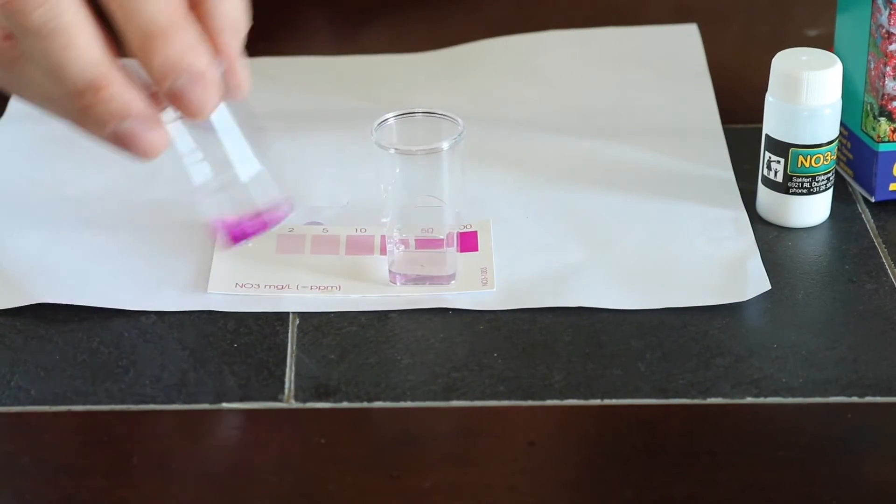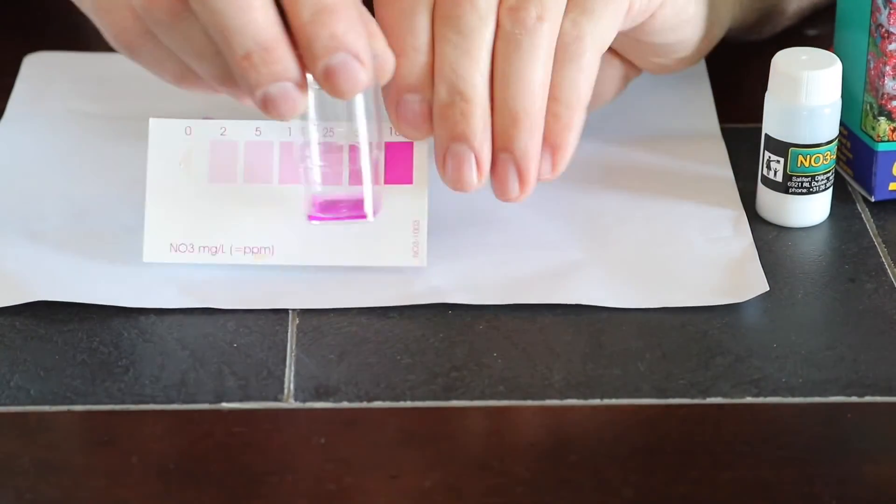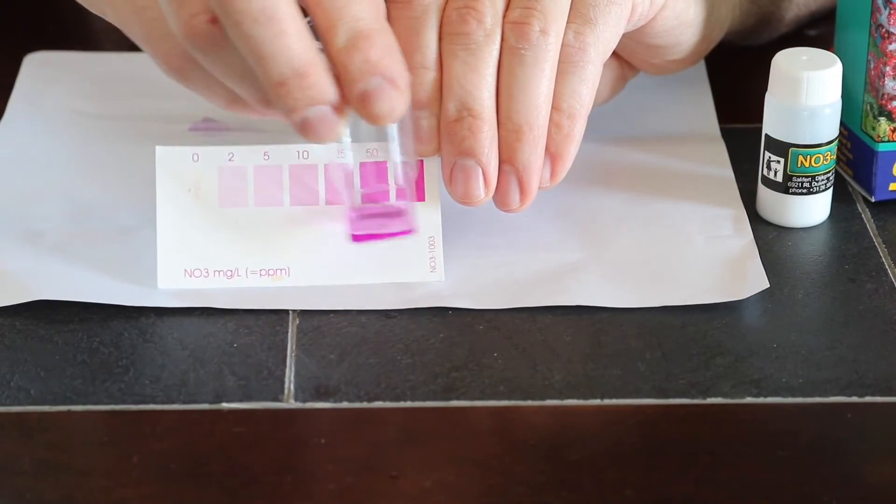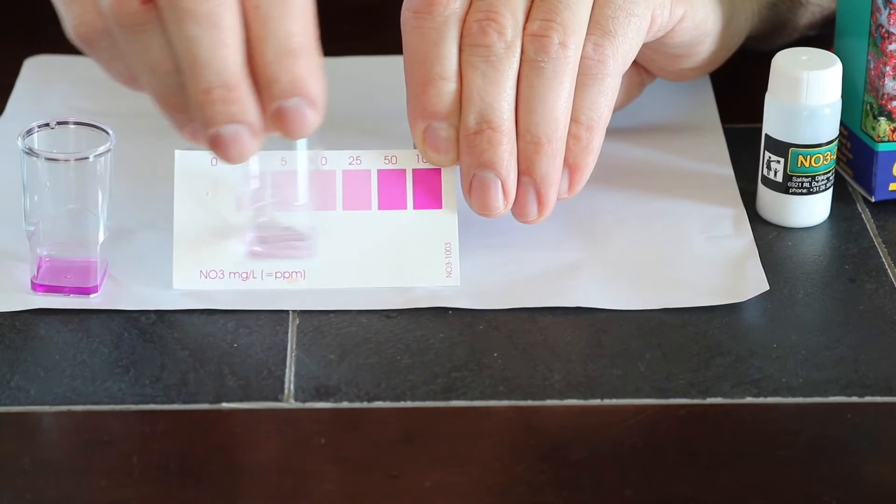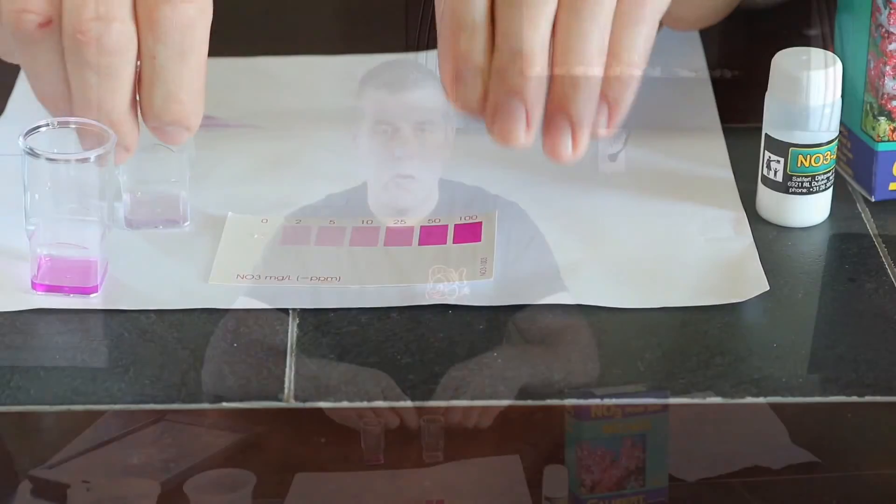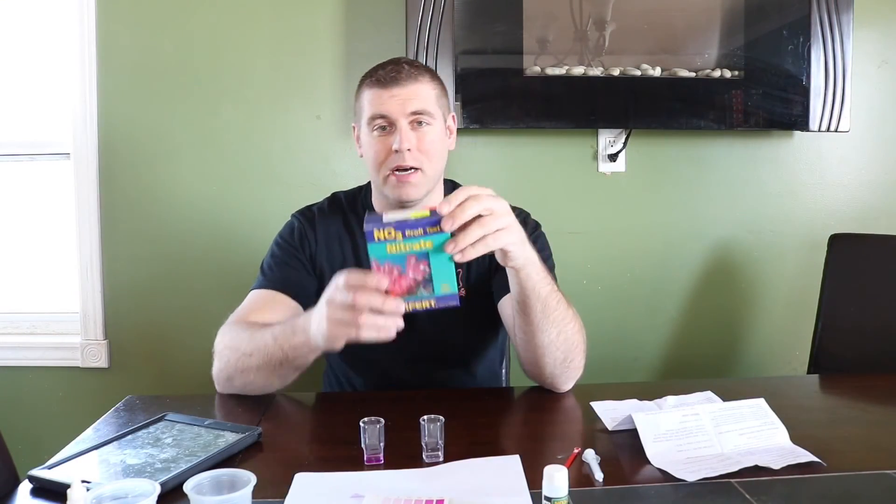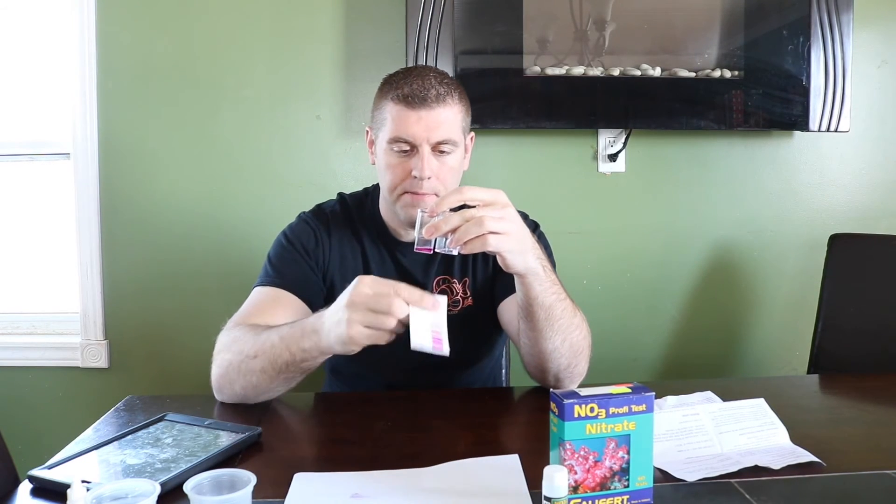And this one, look at that one. You guys can judge that sample. And then this sample. So that's how you test the NO3 nitrate from Salifert. So this is what you see guys. The one on the right, it looks like you want to do a water change ASAP. And the one on the left is looking great. So you just take it and you look at your little chart and you guys can be the judge. So this is how you mix this up. It's so easy to do.